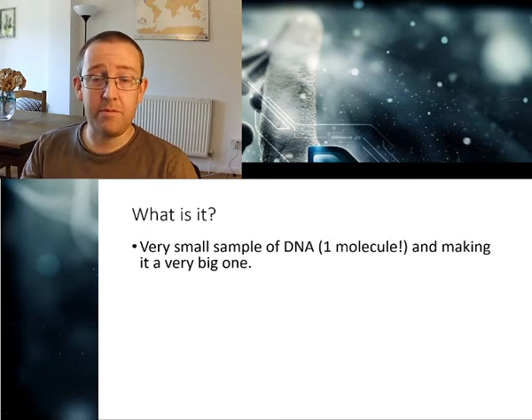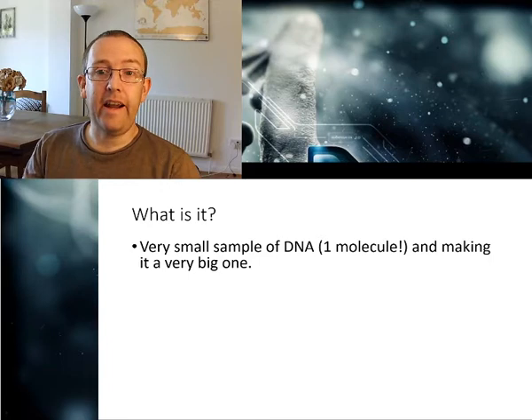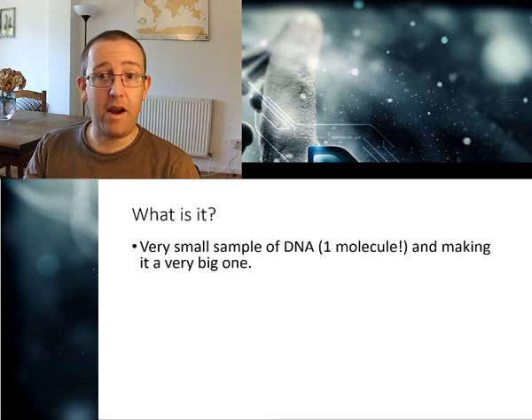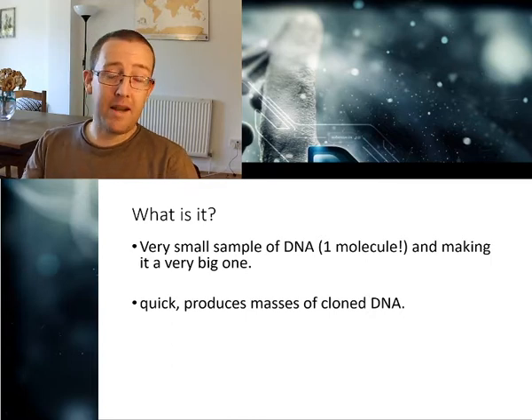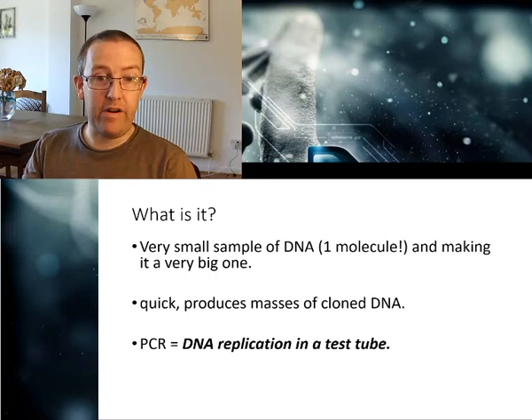Well, essentially it's a means of taking a very tiny sample of DNA, can even be one single molecule of DNA, and amplifying it to make a very big one. That's the purpose, and it is absolutely standard lab practice. It is a real basic in your biotechnology toolkit. It's quick, it produces masses of cloned DNA, it's easy, it's cheap, and it's really effective.